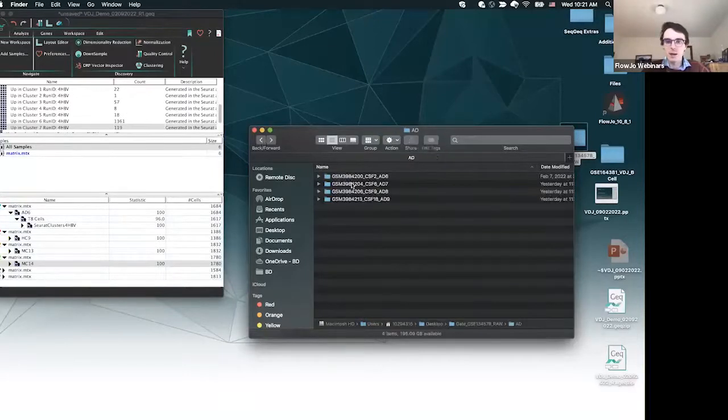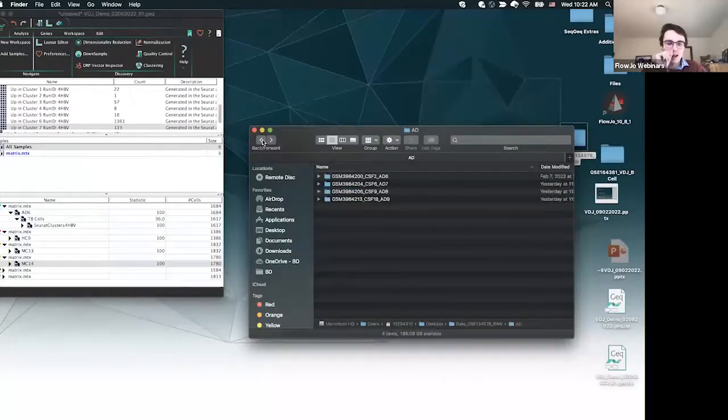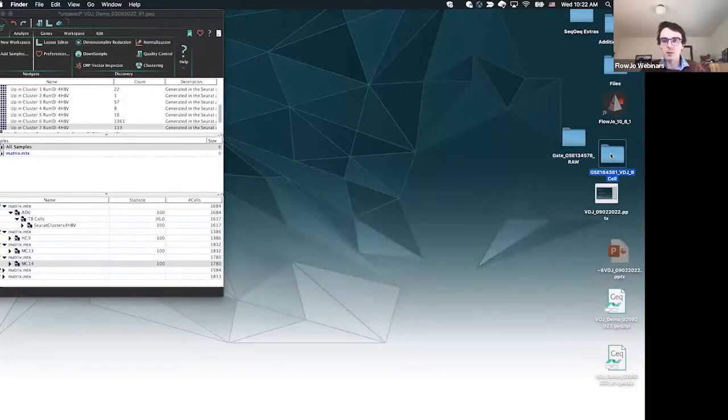Again, it's from the 10x pipeline, so they have these contig annotations files. This is the VDJ information that I need to connect my matrix.mtx file to in order to do my VDJ analysis. And so this is going to be great. There's a lot of information here, so I think this is a pretty cool data set to work with. And there are a lot of cool data sets on NCBI GEO. I actually have a B cell data set lying over here too from NCBI GEO. If you just search in that database, you can find a lot of good data, or you can generate your own data, of course, with either the Rhapsody or 10x pipelines.